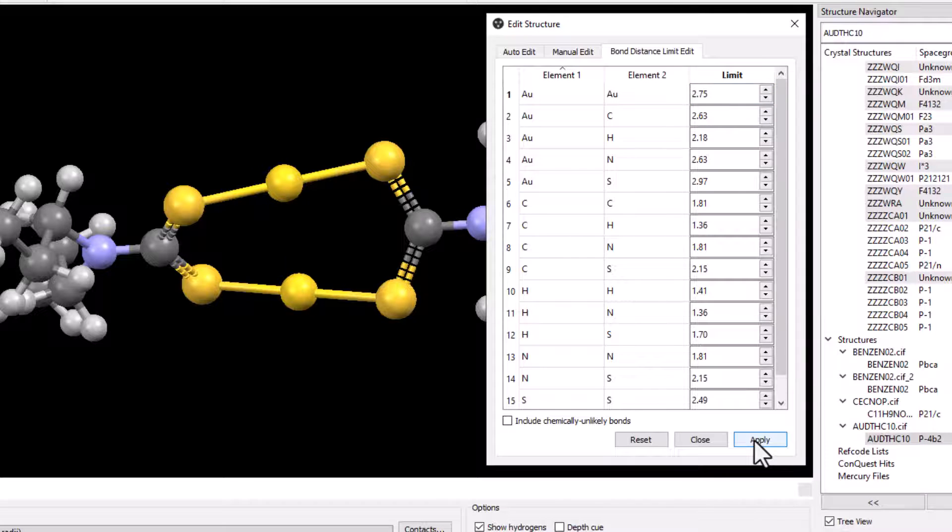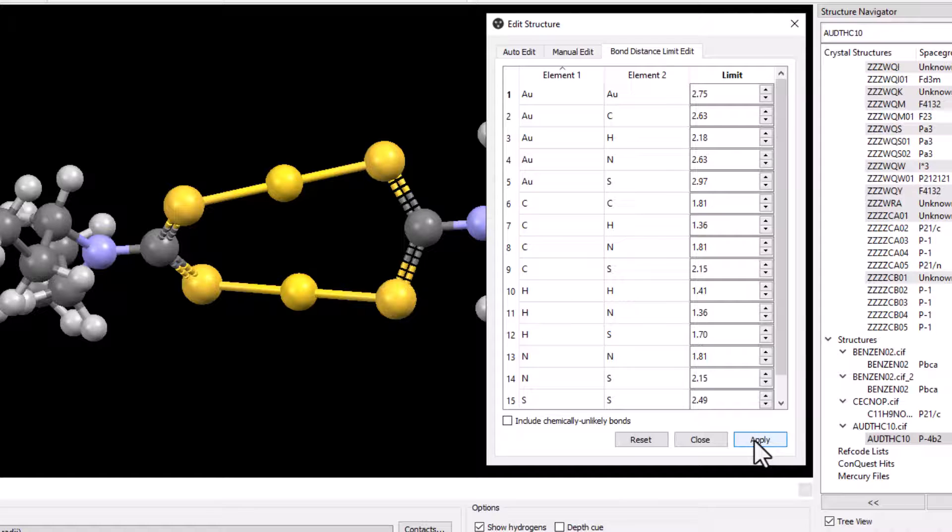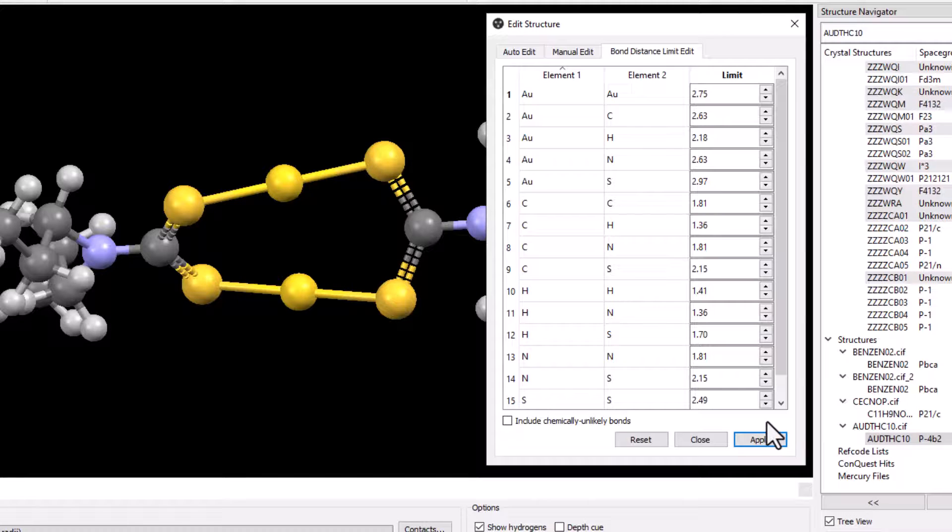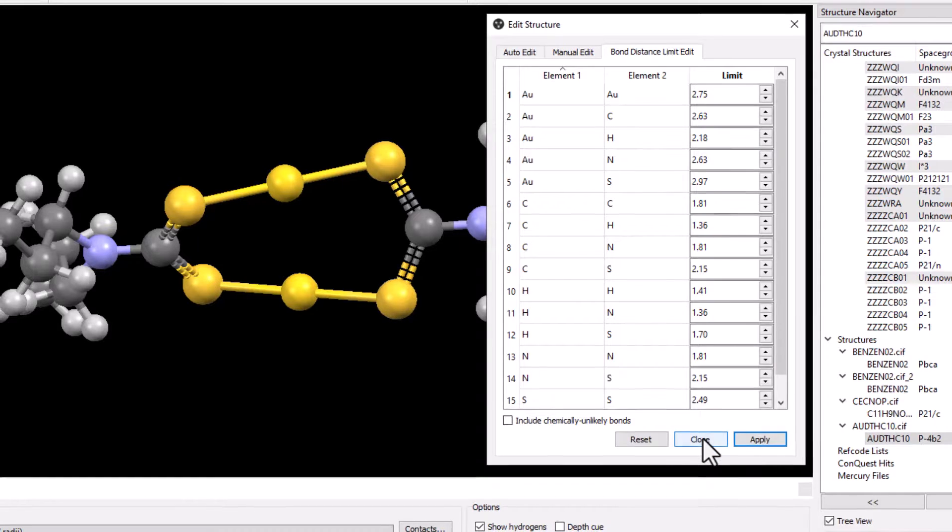You can see the central AUAU bond disappear as the distance between these two gold atoms is longer than the 2.75 angstroms limit that we set. This is no longer a viable bond that can be made based on the reduction to the bond distance limit.